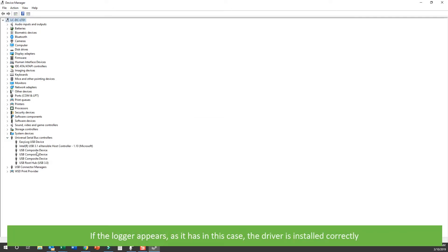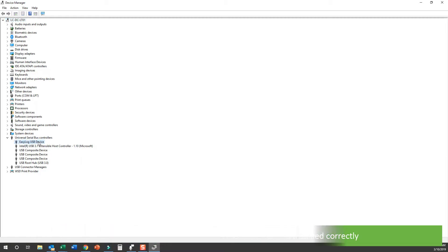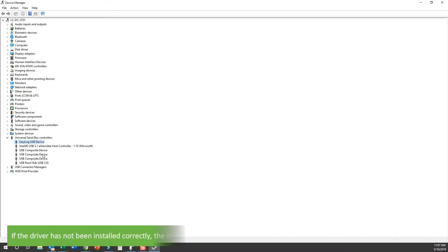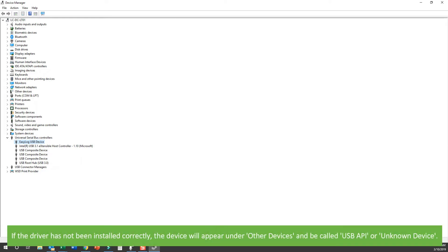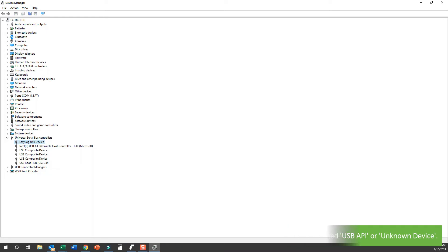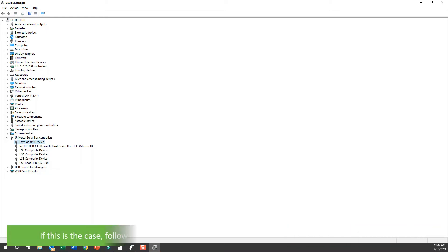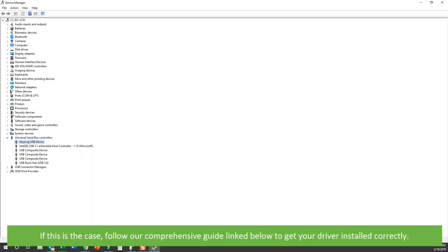If the logger appears and is named 'EasyLog USB Device', that means the driver is installed correctly. If the driver had not been installed correctly, it will appear under 'Other Devices' and the USB data logger would be called 'USB API' or even 'Unknown Device'. If this is the case, follow our comprehensive guide linked below to get your driver installed correctly.